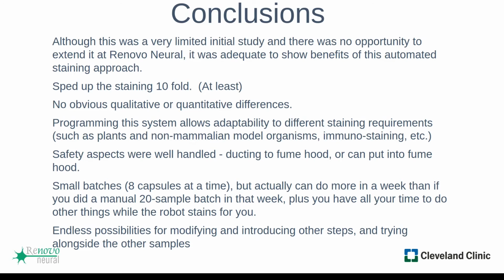So it's actually really nice, and you have all your time to do other things instead of having to stand there moving around hazardous liquids when you do manual staining. There are also endless possibilities for modifying and introducing other steps or trying alongside other samples. So that kind of wraps things up.